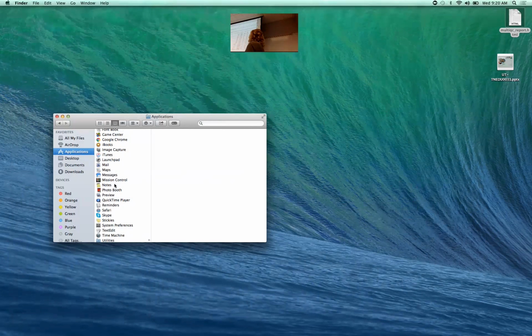And then all of a sudden, this pane over here is the file system on your laptop, and this pane over here is the file system on Beacon. So now you can navigate to your files on Beacon. And I'm just going to change this up here to Lustre Medusa.